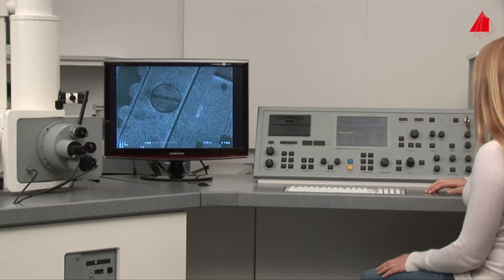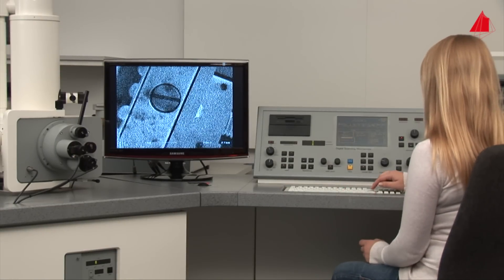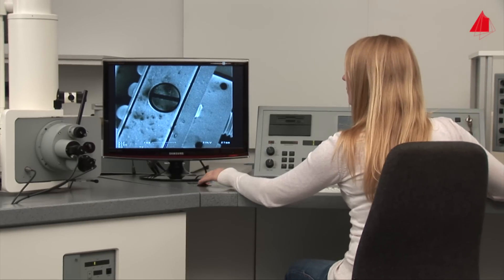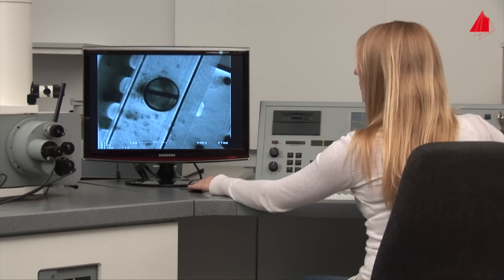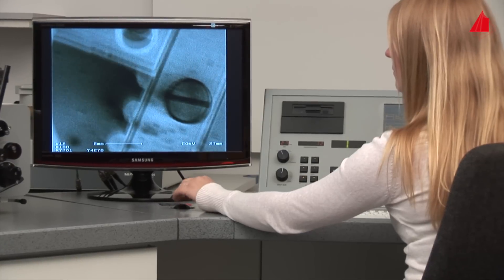For the first time, a reasonable image appears on the monitor — it shows part of the specimen stage. Using the trackball, she moves the stage within the microscope, looking for the place where the first sample is positioned.